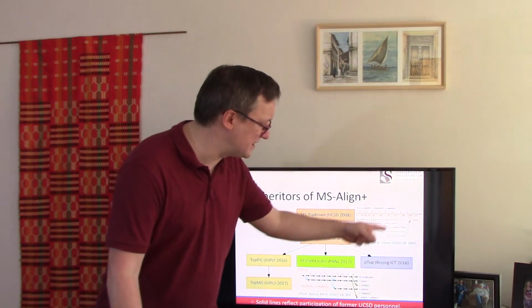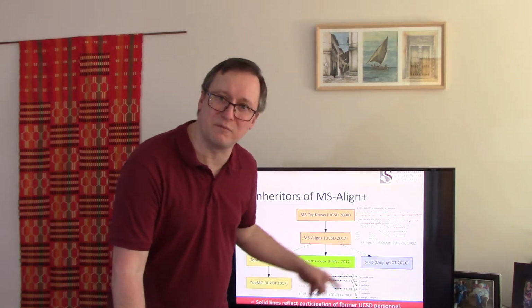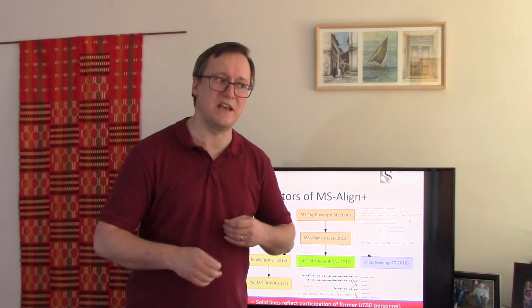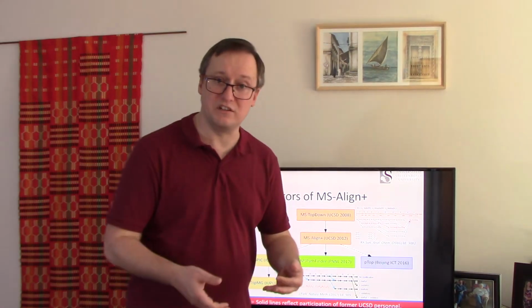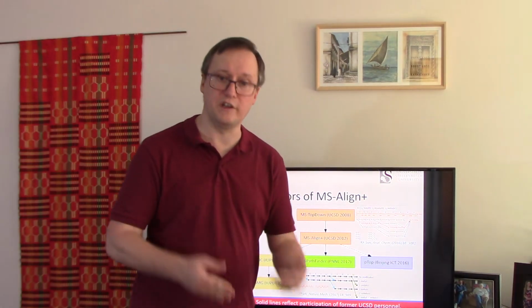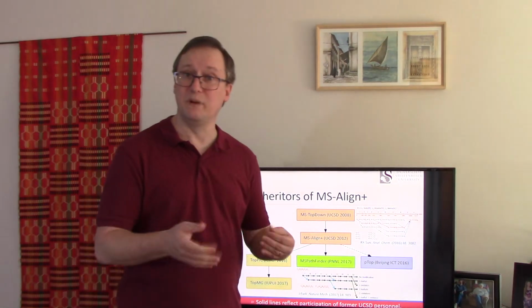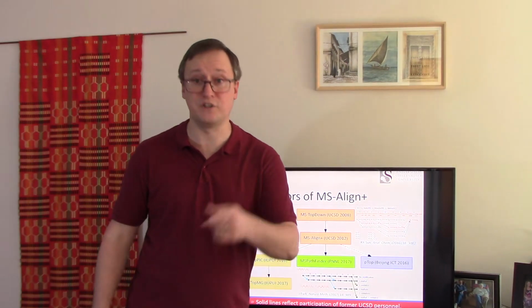But just by looking at the diagrams, it should be pretty apparent that both of these routes are handled via dynamic programming. That this has become an idea that has come to be dominant among the computer science heavy groups that focus on the interpretation of tandem mass spectrometry. So I'm really excited to see so many different options have evolved now in the space of tandem mass spectrometry for top-down.